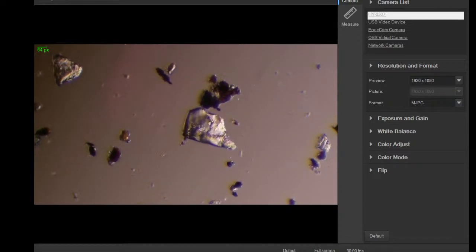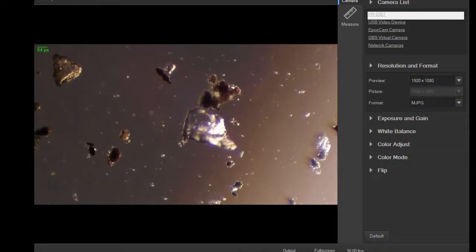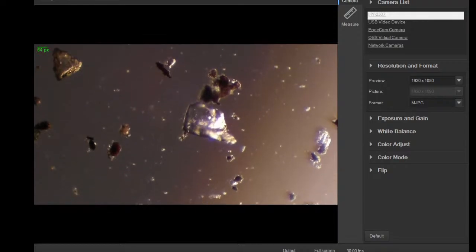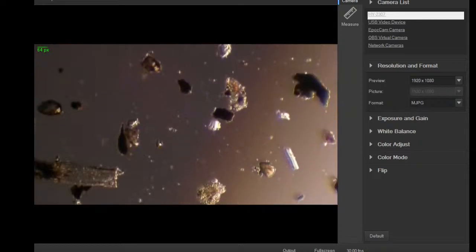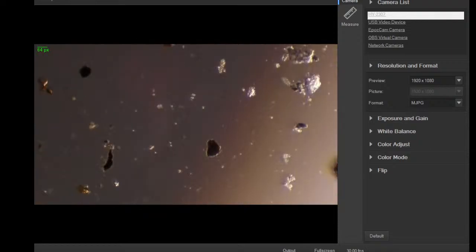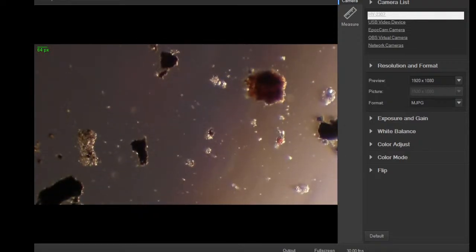It's almost like glass when it's very small. And you can play with the oblique lighting here and get some cool kind of bio art. There's a cool shot there. A little bit of mixed oblique lighting and a little bit of edge of dark field. Nothing else moving.